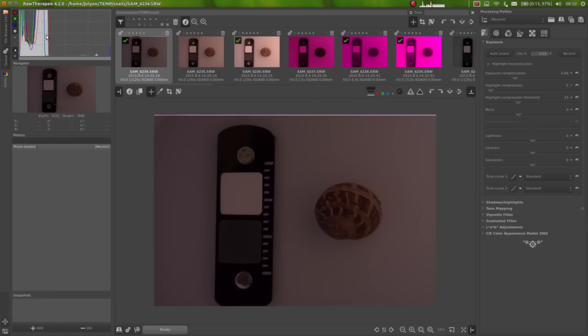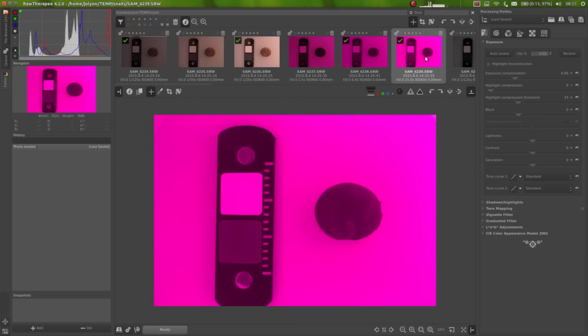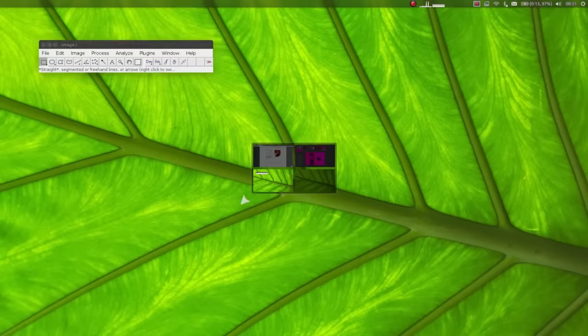And again, this image looks underexposed. This is all a wasted region where there are very few pixels. So all of the pixels are clustered around very low values, which means although this image would probably be usable, it would be a very noisy image. So this image looks good, and this image looks good. So now we can go back to ImageJ and make a multispectral photo from these two.